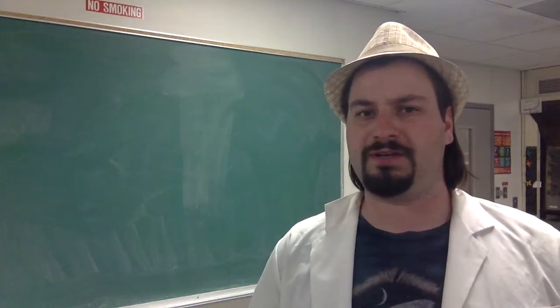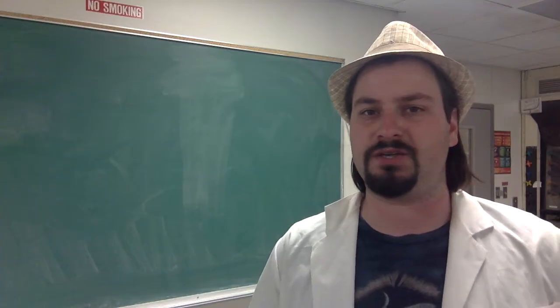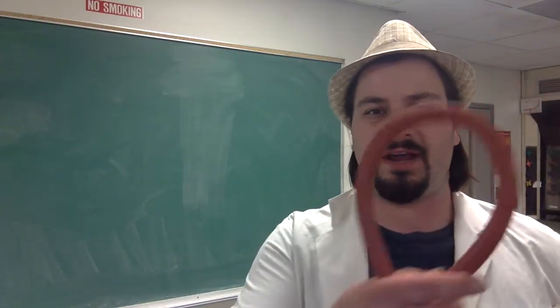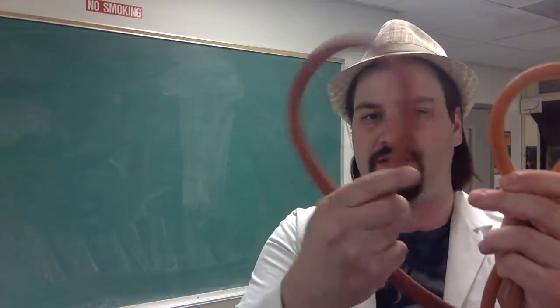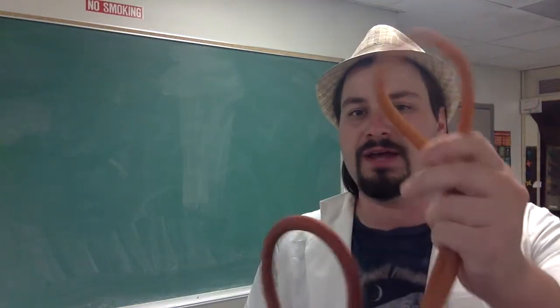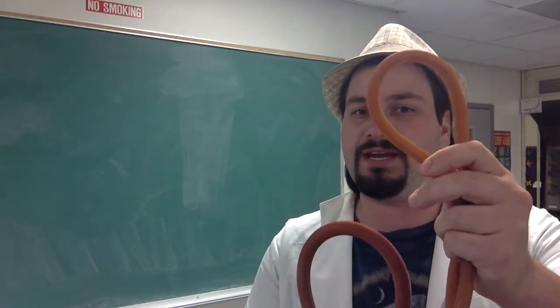Once you're ready to set up your water-cooled reflux condenser, go get yourself some latex tubing. That's this light orange one, and not this dark orange one, which is much thicker. This dark orange one is for vacuum, it's made out of rubber. This light orange one is made out of latex, and that's what we're going to be using for water carrying.